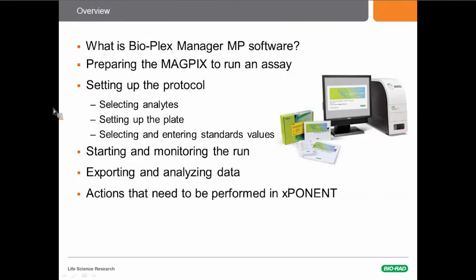We will be discussing the following topics: what is the Bio-Plex Manager MP software, preparing the MagPix to run an assay, setting up the protocol — which includes selecting the panel or analytes — setting up the plate, selecting standards and entering the standard values, starting and monitoring the run, and exporting the data to Bioplex Manager and analyzing it. We will also cover some actions that will still need to be done in the xPONENT software.